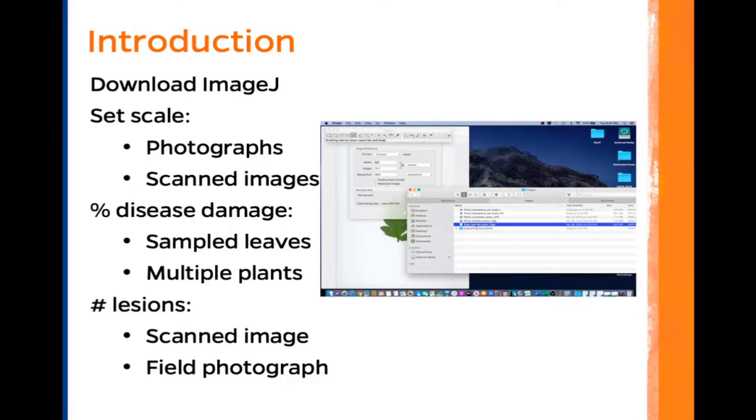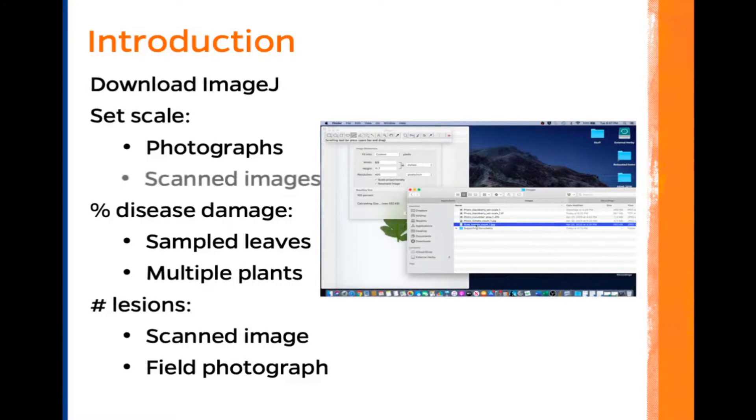This is the third in our movie series, and in this movie we are going to set scale for scanned images.